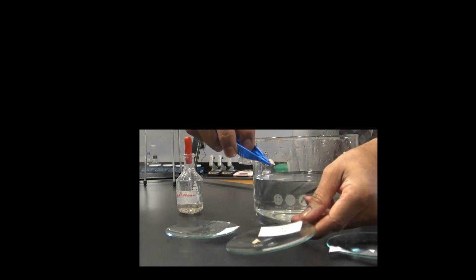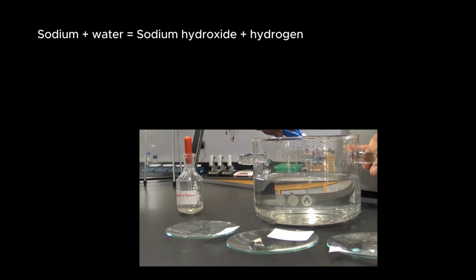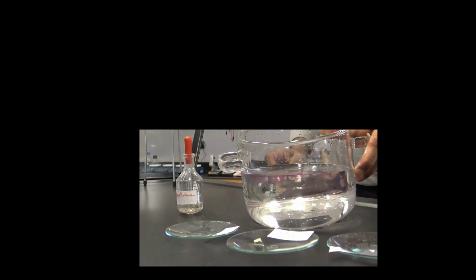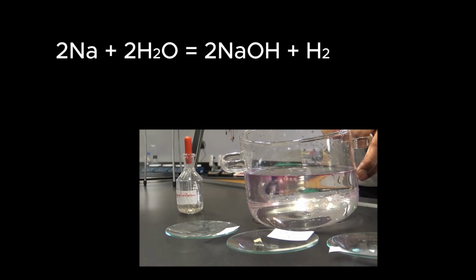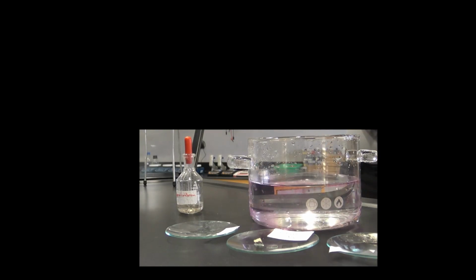I expect the reaction will be faster than lithium, and the gas will, of course, be hydrogen. You can see the reaction is faster, it becomes a ball quicker than the lithium one, and darts around the water forming a purple color, which means the reaction is faster. Lithium is less reactive than sodium.